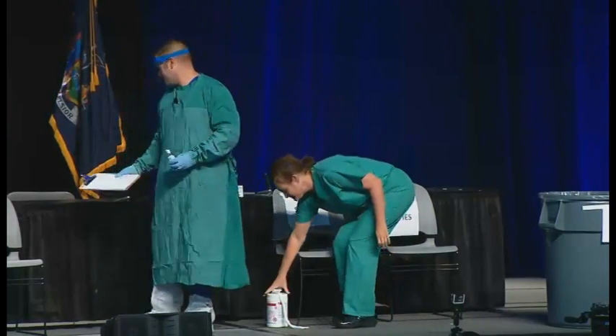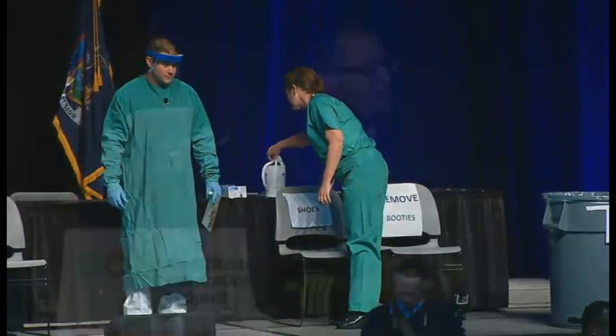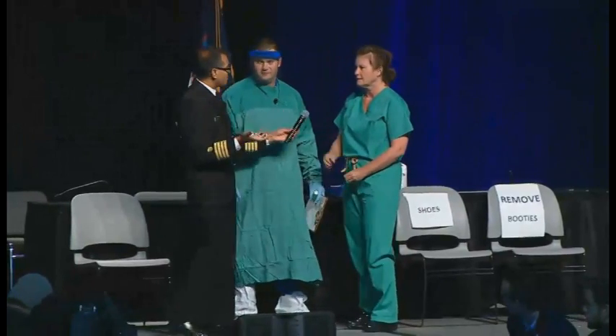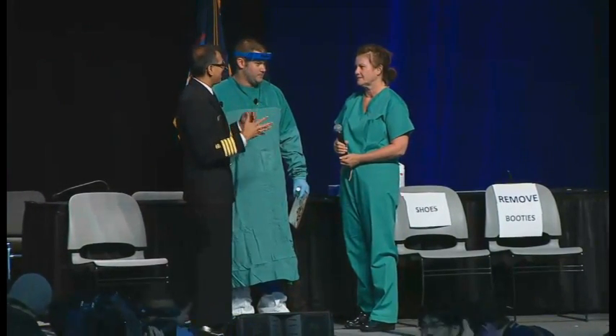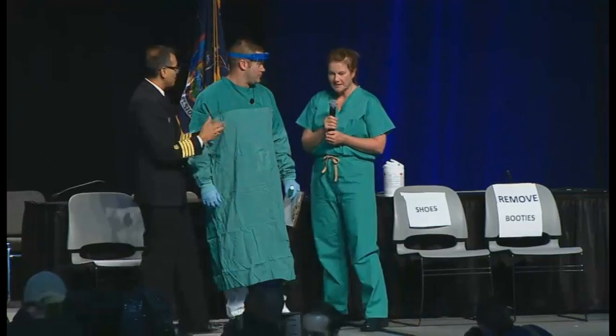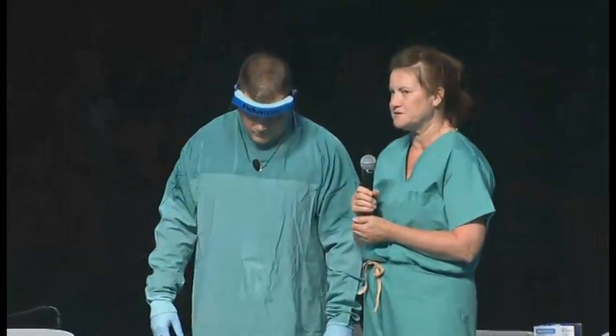Let's give them both a huge hand — this is really difficult to do with a huge audience. I really want to thank them so much for walking us through this. Barbara, maybe you can tell folks a little bit about what it was like to do the training the first time. Having done training with this and a couple other models, it's tantamount to your safety to just practice, practice, practice. Don't think that even just removing the gloves — you've done that hundreds of times in a week — just don't rely on your past knowledge. Have somebody vet that you really know how to do each step of the way.